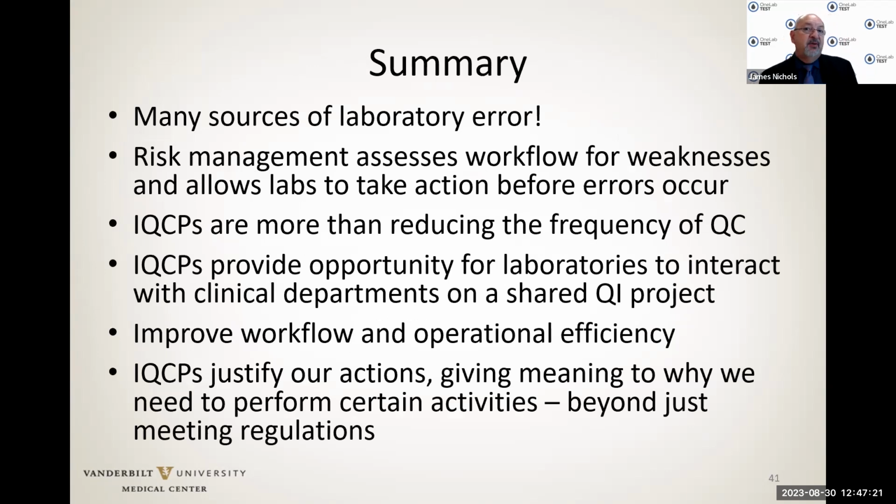So in summary, there are many sources of laboratory error. Risk management assesses the workflow for weaknesses and allows labs to take action before errors occur. Our IQCPs are more than reducing the frequency of QC. In fact, some mitigation steps may say you need to do more QC.